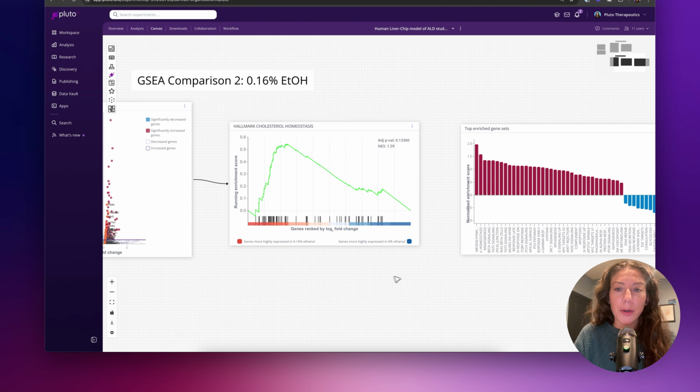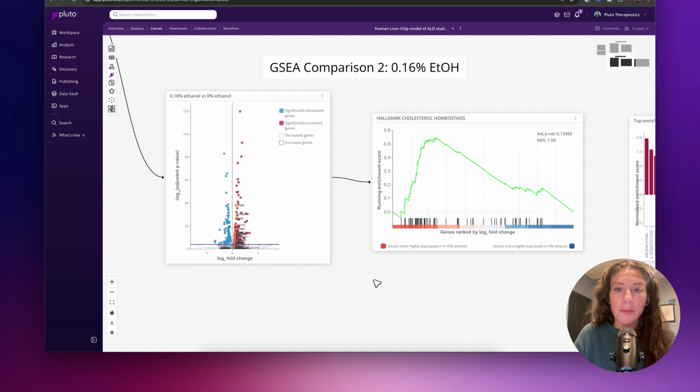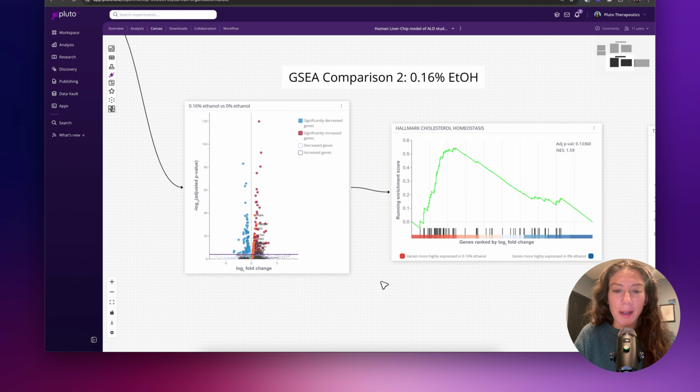So feel free to dive into that longer form video that I had recorded, but hopefully this was just a really bite-sized overview to get you started.